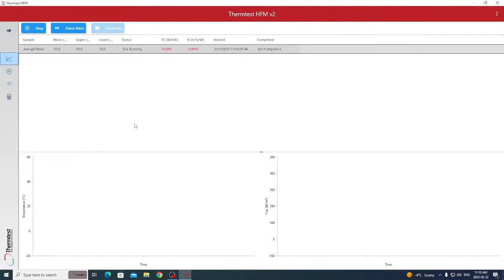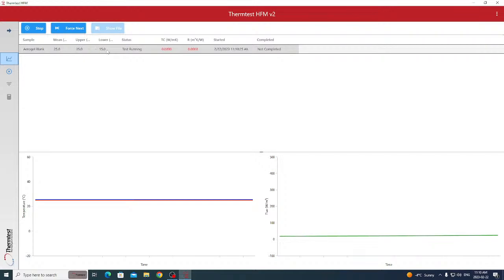So here's our measurement proceeding from room temperature. Each plate was sitting at room temperature. There's no external cooling needed. That's all fan-cooled thermoelectrics. So the 2 plate temperatures will start to heat and cool to their corresponding temperatures that we set, which, as you can see above, is 35 and 15 degrees. So we can wait a moment. Actually, what we'll do, we'll go look at the review data on the same sample, and we'll come back and you'll see the plates start to go to those temperatures.